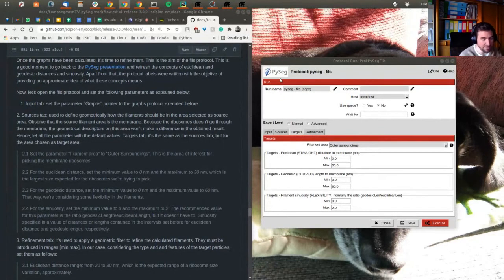The filaments are like a refinement of the graphs. The graphs are a mathematical object which is used to connect nodes that may represent any different entity in a phase space. Let me try to explain it.